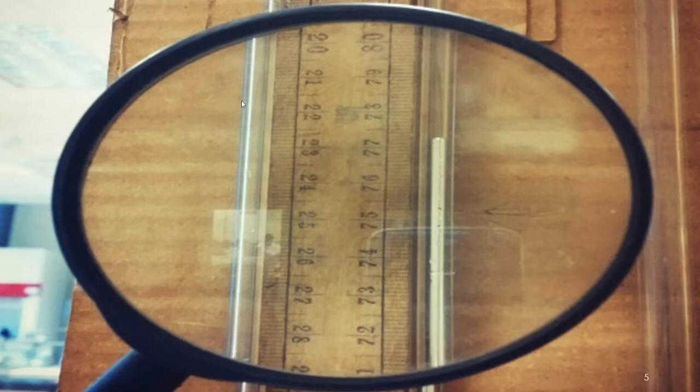You will need this because it's quite difficult to look at the little numbers and the lines. This magnifying glass actually helps.